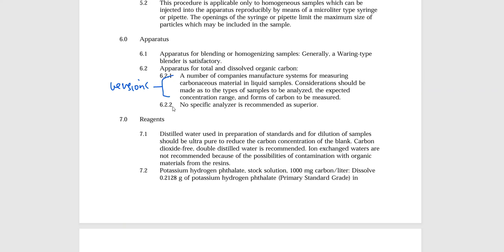But if you're going to be running samples that have higher than 1 ppm, then absolutely a machine like ours can be used, and a machine like ours is going to be commonly found in laboratory settings. So I don't want you to feel like you've been gypped, because you've not been gypped, because quite honestly, a lot of bachelor's degree candidates have no training on TOC.